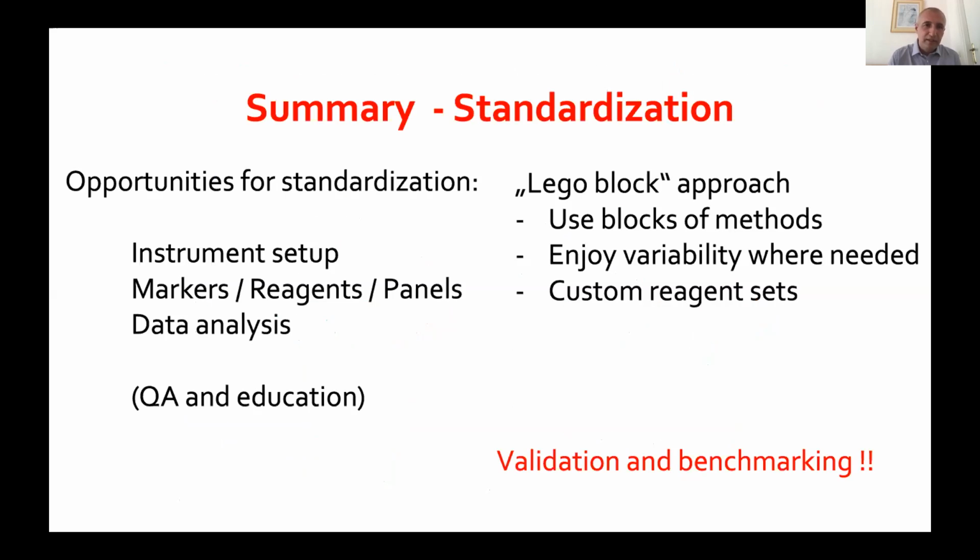So in summary, standardization is an opportunity where we can nail down and eliminate all the differences in instrument setup, markers, reagents, panels, and possibly data analysis. And I think that in the future, we will see more of a Lego block approach where part of the procedures will be standardized and others will be tested and benchmarked and gradually improved.